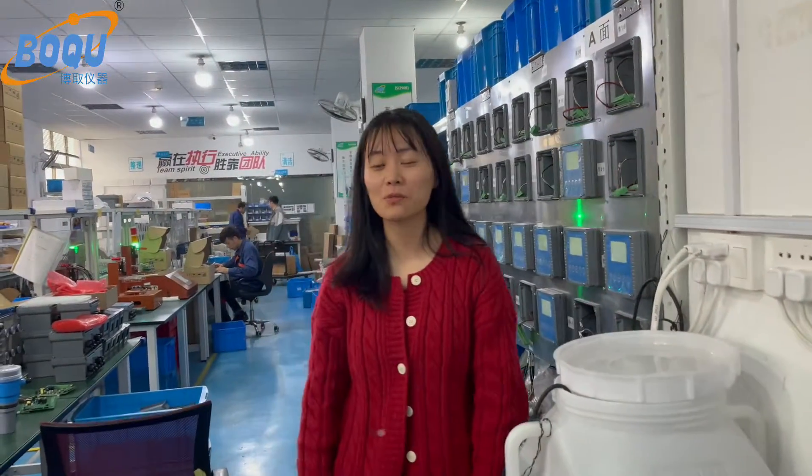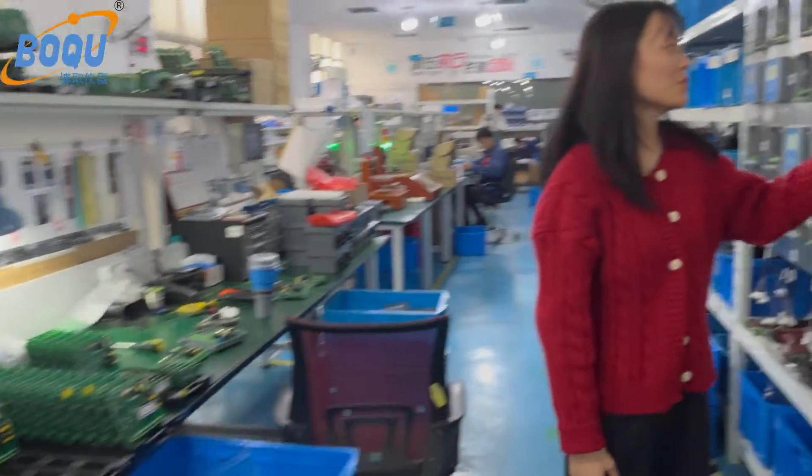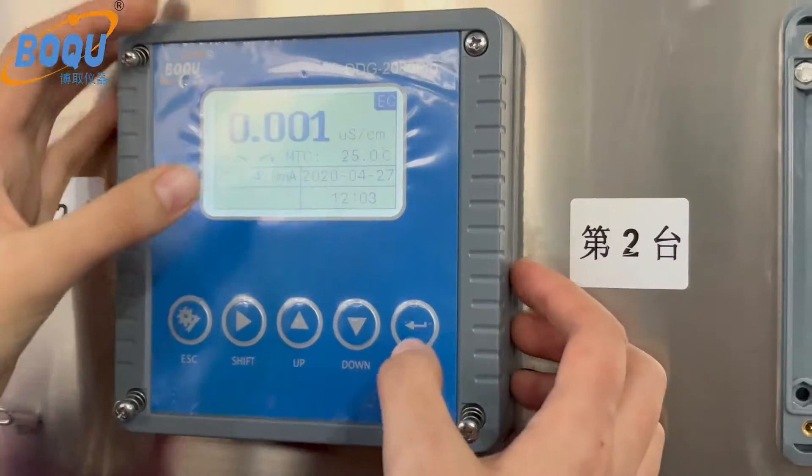Hi, it's Ming from Valky's Tournament, and this is our factory. Let me show you our new production conductivity meter.